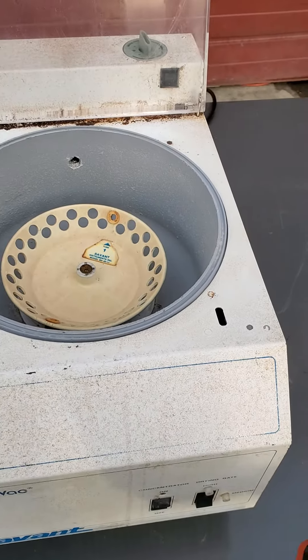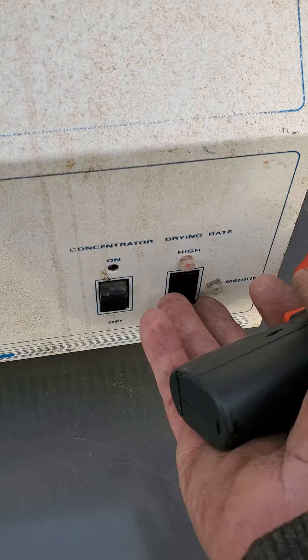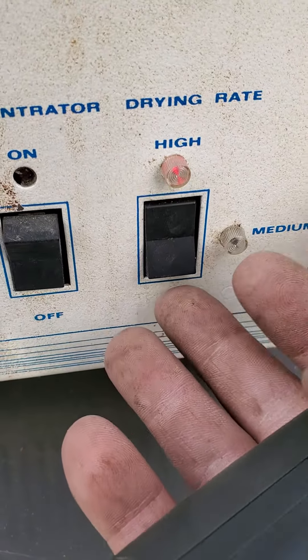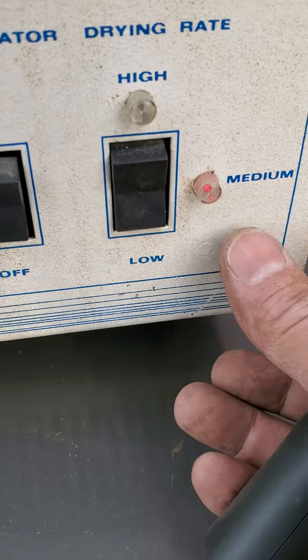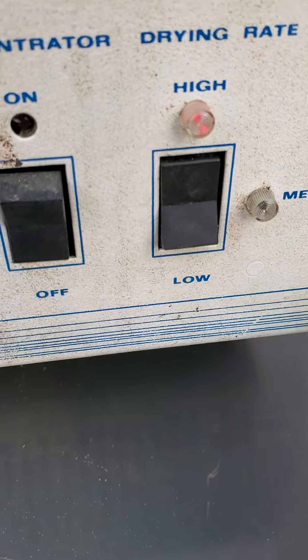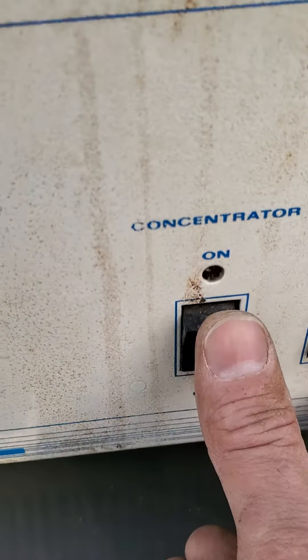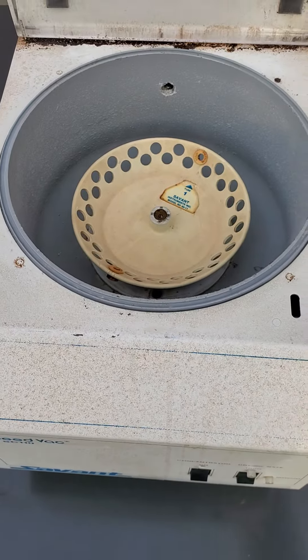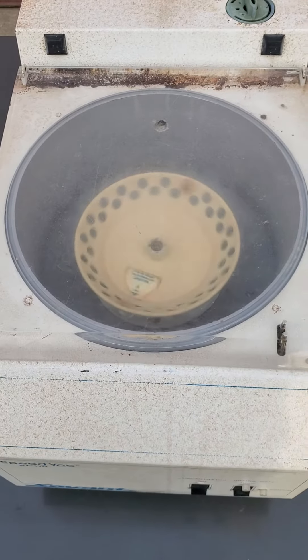The heat is already on, as you see, on high. You can adjust it to medium — the light goes on — or to low. We're going to put it on high and start her up.